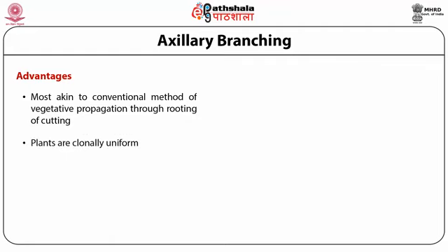We give growth regulators that favor shoot growth, which shows bud break, and you maintain the right concentration of inorganic and organic salts so that the shoot keeps on growing. This way you can get a large number of shoots, which can then be put for rooting purposes.